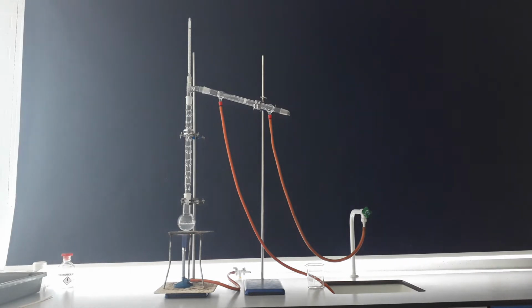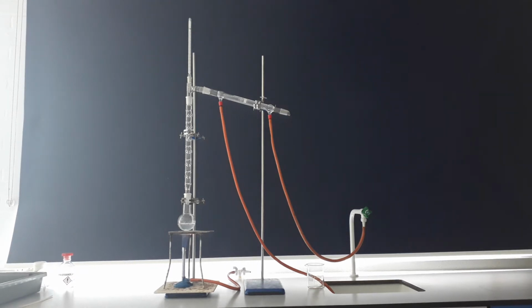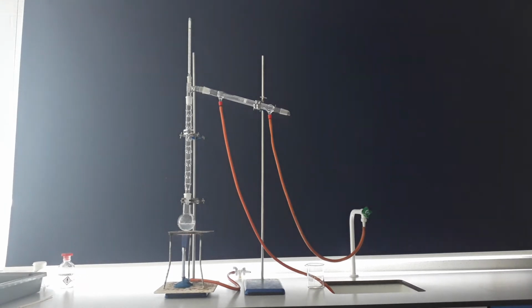In the setup that you can see, we have a round bottom flask which is placed over a Bunsen burner which is heating the substance in there. We have ethanol and water in our round bottom flask. We then have a tall column going up. This is called a fractionating column. Now this is usually used when we have more than two substances that we wish to extract.